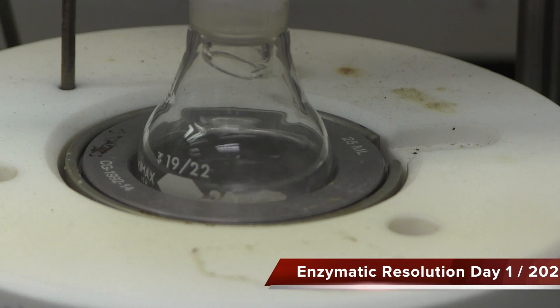In this lab, you will be separating enantiomers of a racemic alcohol mixture by using an enzyme and silica gel chromatography.